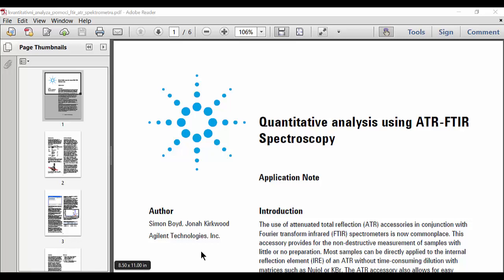I found this application note on quantitative analysis using ATR-FTIR spectroscopy where they show how mixtures of ethanol and water can be analyzed using this technique.